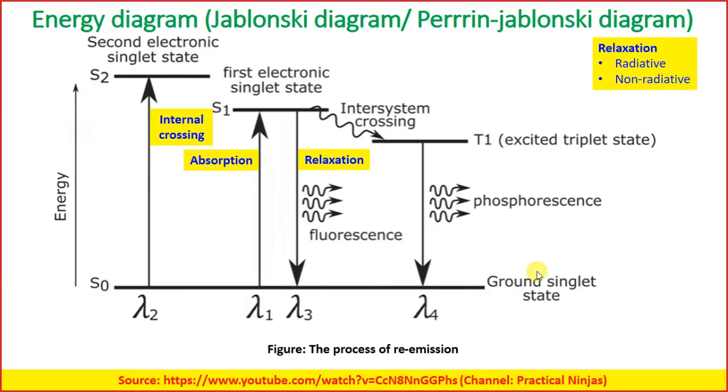Sir, why is there delay in case of phosphorescence as compared to fluorescence? There is some intersystem crossing, but the delay is for... See, if I slap you, you may react in a delayed fashion. If I slap your partner in the class, he may react very quickly. So it's the internal property of the molecules, how they will be reacting. And there might be some chemical reactions going on within that, which may take some time.